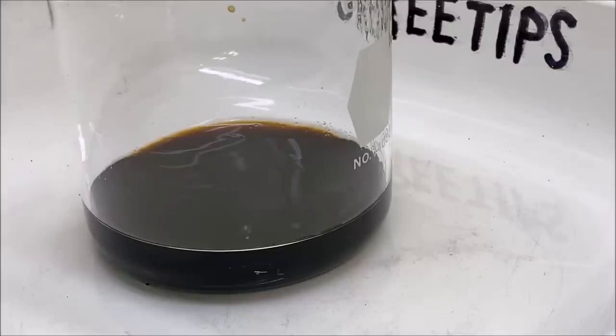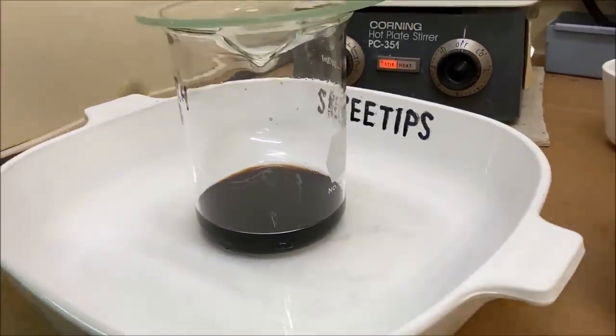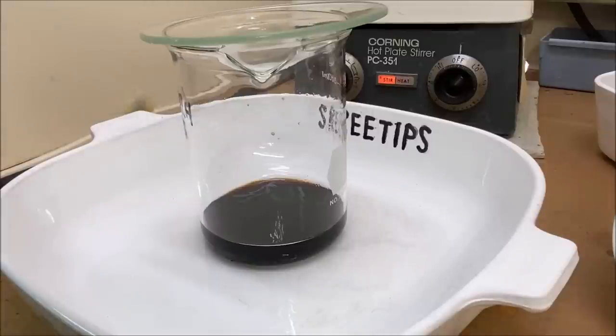Let this settle out and cool down, and with that much aqua regia, we should have all of the platinum in solution now. But I did see some solids in there. Don't know what that is, so we'll cool this off, let it settle. We'll take a look and see what we got in here.